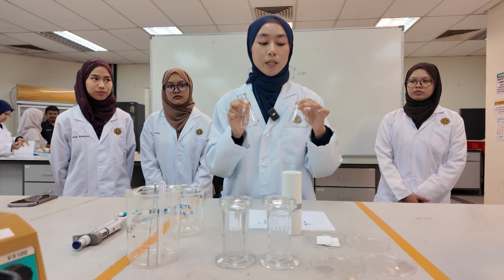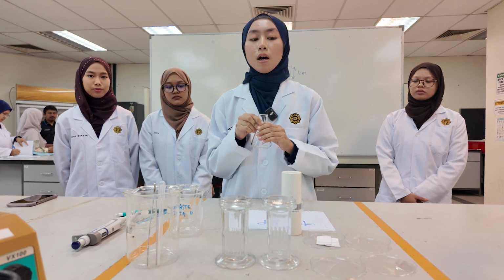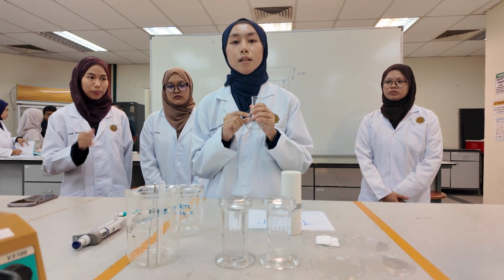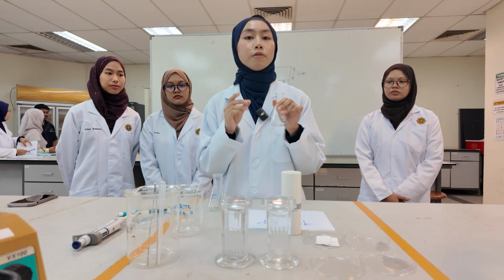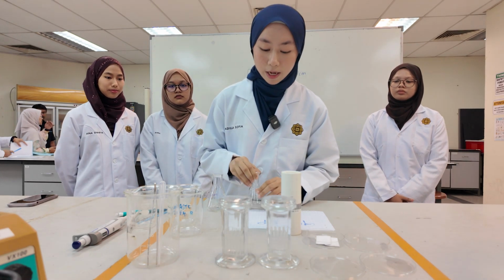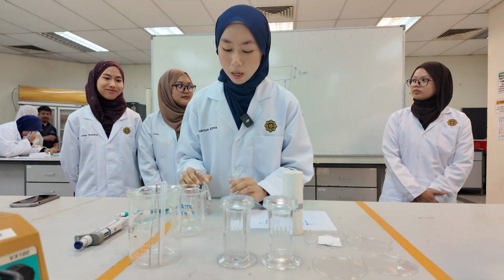Two developing solvents. The first developing solvent is in a ratio of 9:1, hexane and ethanol, and the second solvent is also in a ratio of 9:1, dichloromethane and hexane. So now we have both flasks in 10 ml of developing solvent.